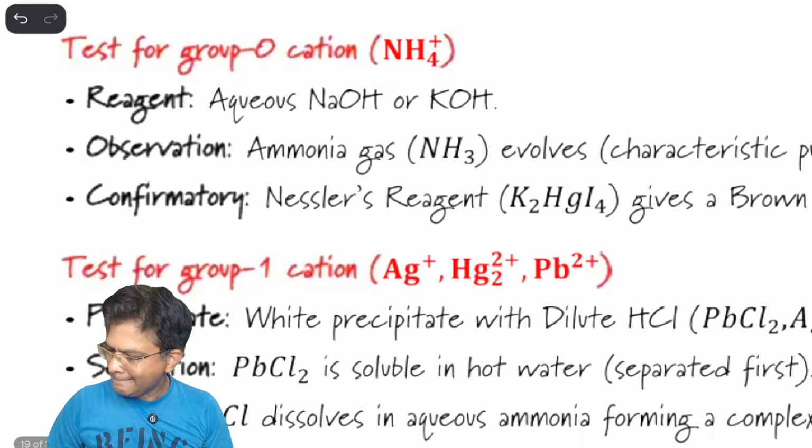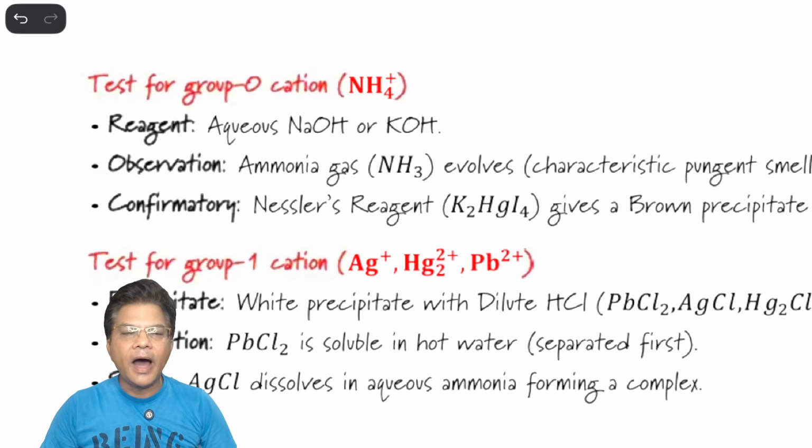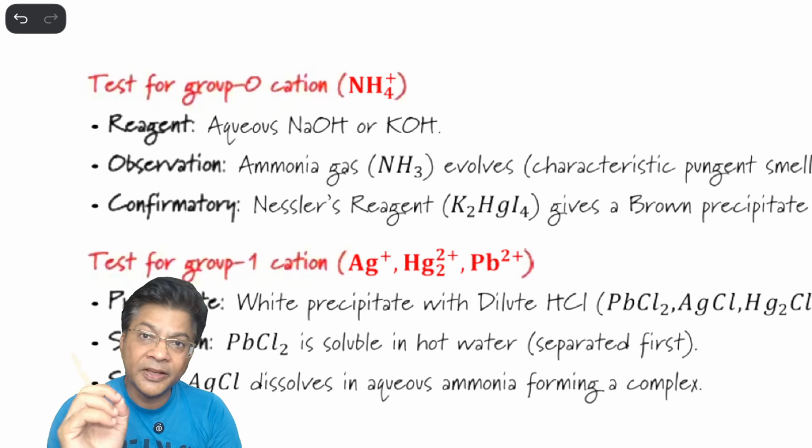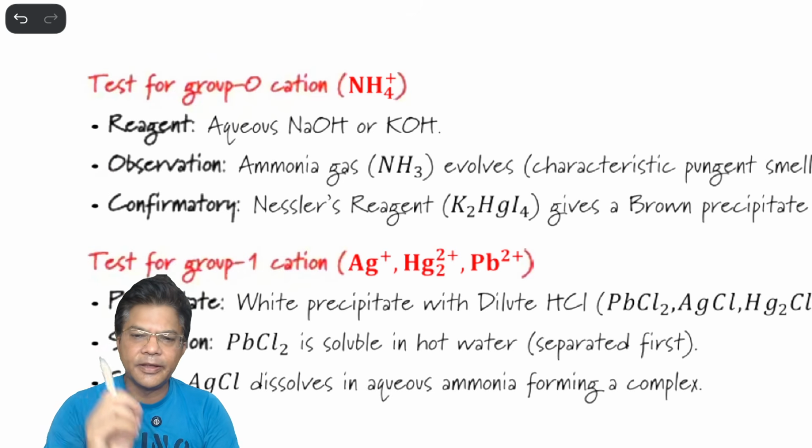Now see, to identify whether ammonium is there or not, there are a number of simple experiments, but the best one is Nessler's reagent test.